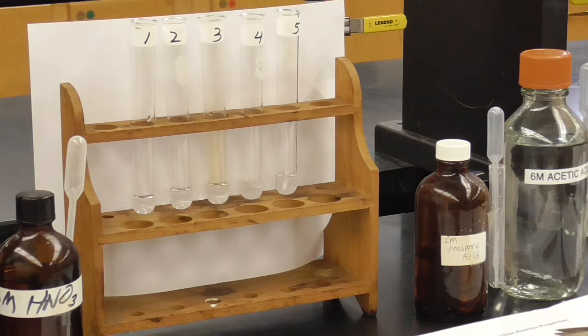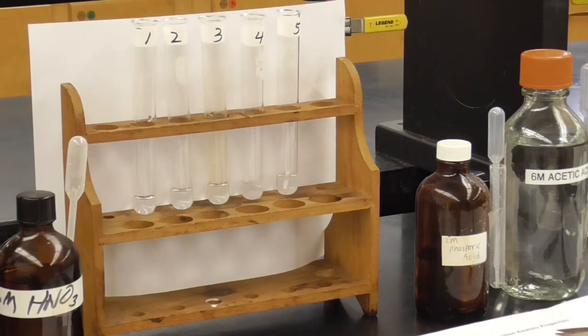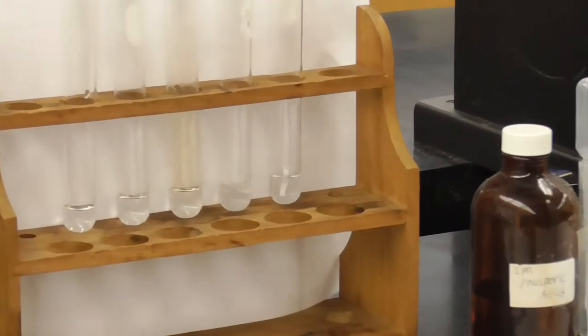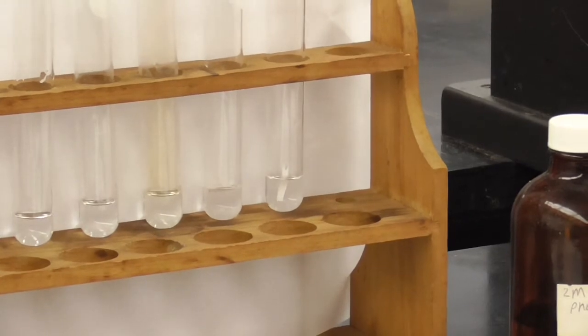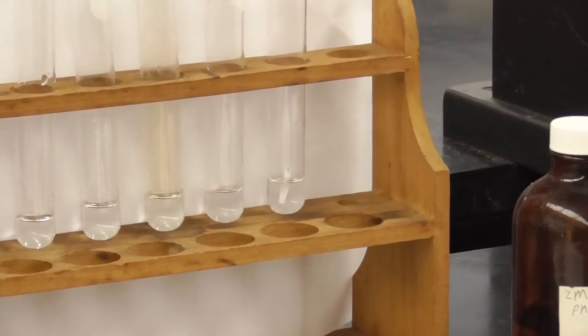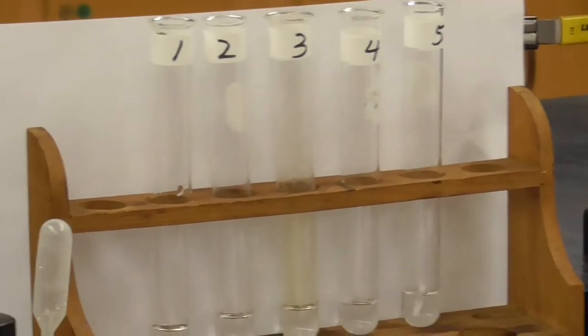You see the bubbling coming up from the various ones. That's, again, the metal reacting with the acid to produce hydrogen gas. And so those little bubbles are hydrogen gas coming up out of the solution. You can tell which ones are reacting quickly or slowly by watching for that hydrogen gas, and also, of course, watching for the disappearance of the metal.